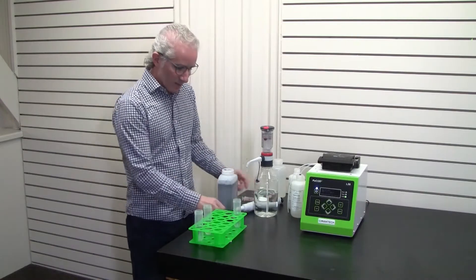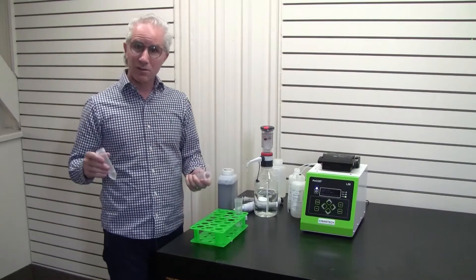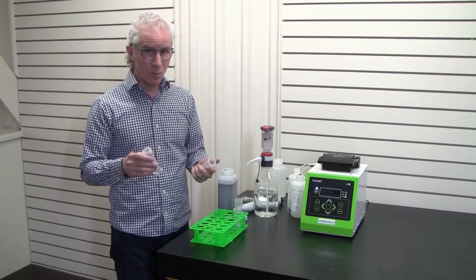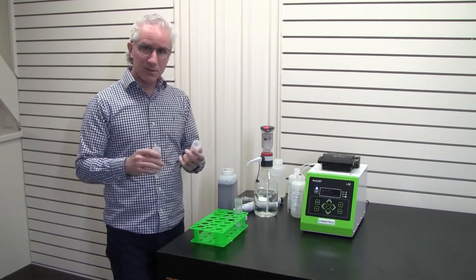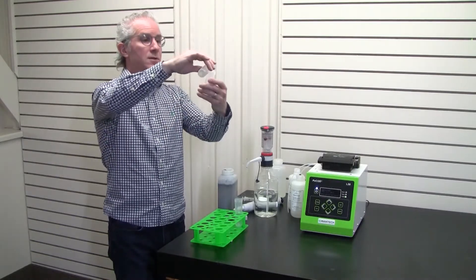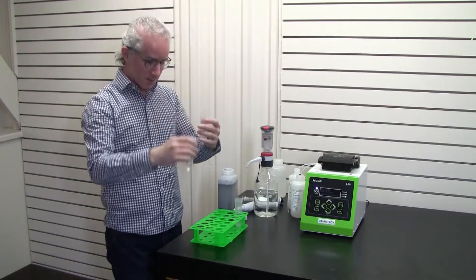Now we're going to do the pre-dilution step using the markings on the tube itself. You can use a pipette, a graduated cylinder, or a measuring cup. We're going to do a one-to-one dilution, or 50%. So we bring it to the five mil mark, then add five mils of deionized or distilled water from the grocery store — just like so.